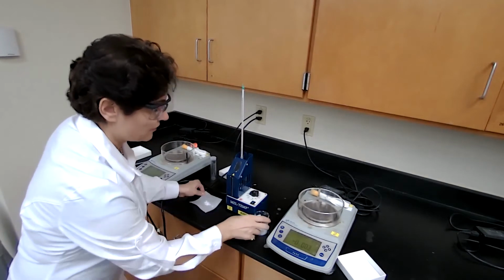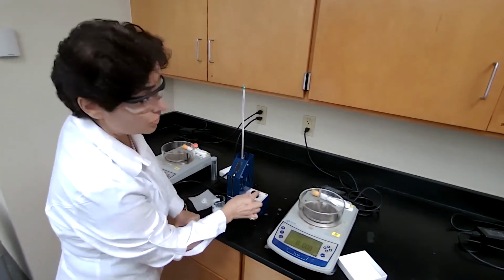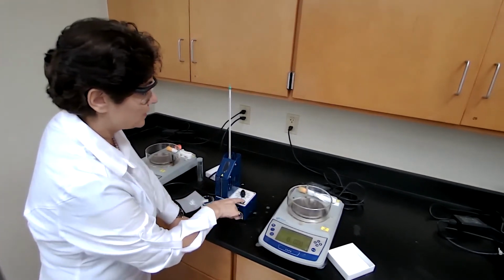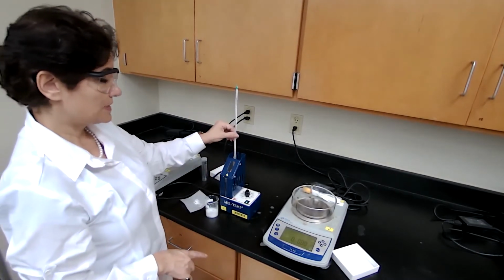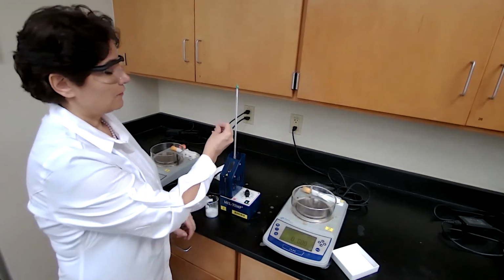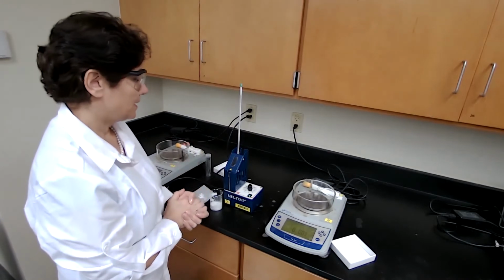The melting point of a pure sample of our neutral compound, which because it's fluorene, is about 110. And the setting, based on the chart that we talked about in the first class, is going to be around 410. We turn it on, wait for the sample to melt, and record the temperature. I would record the initial melting when I see droplets of liquid in the bulk of the sample, and the final temperature for melting as soon as the entire sample is melted.